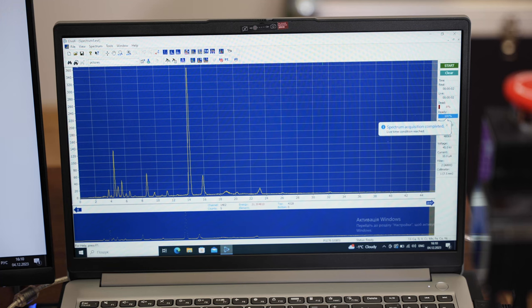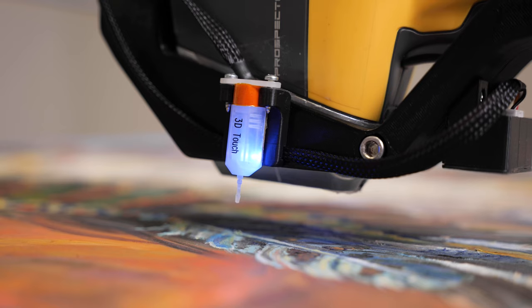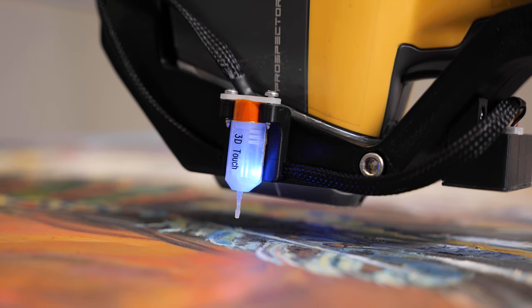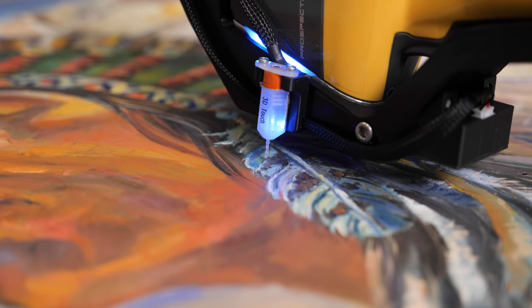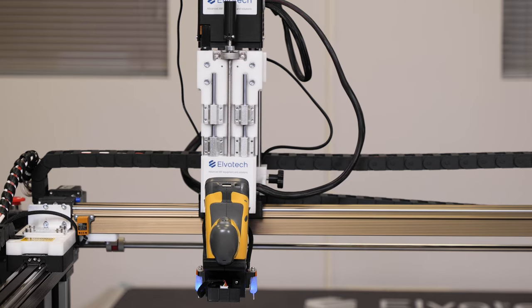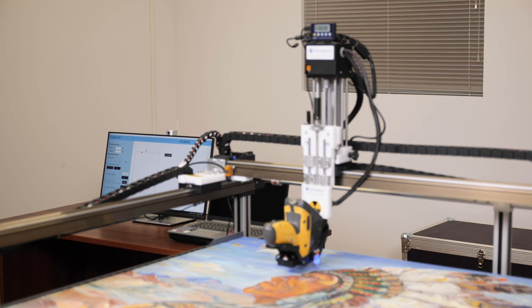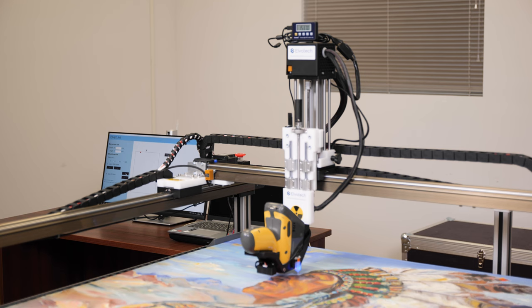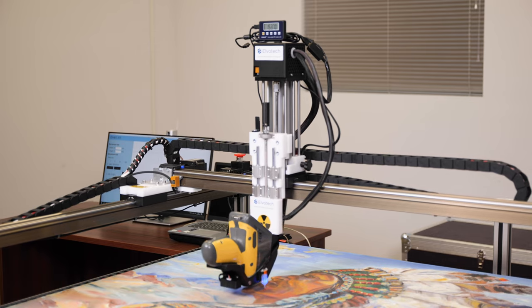On the screen you can see the results of the analysis. This information is critical for art historians to determine if the composition of materials is consistent with those used by artists in certain historical periods. For example, the presence of certain elements may indicate that the painting was indeed created during the period of the Renaissance, while the absence of certain characteristic components or the detection of modern materials may reveal a fake. This makes Elvox Art a powerful partner in determining the authenticity of works of art, helping to distinguish originals from fakes.